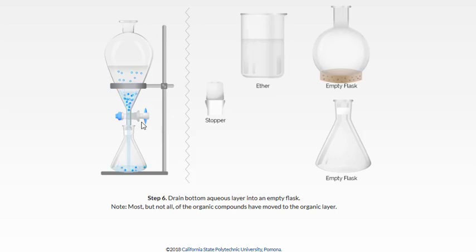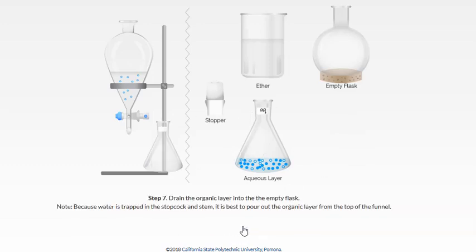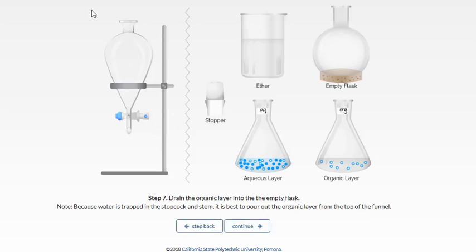We're done with our first extraction. Open up the stopcock with the stopper removed, drain the aqueous layer, then drain the organic layer. A better practice is to pour the organic layer out through the top of the sep funnel so we keep our organic layer as water-free as possible. Notice that we've labeled our flasks — that's really good practice because it's easy to get mixed up, especially if both solutions are clear and colorless.